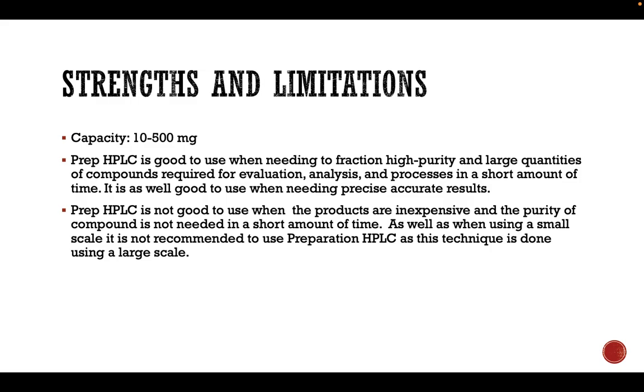Like I said before, with pharmaceutical companies, impurities can lead to effects in the chemical activity and toxicity. So when needing precise, accurate results, that's when you would use a preparative HPLC.